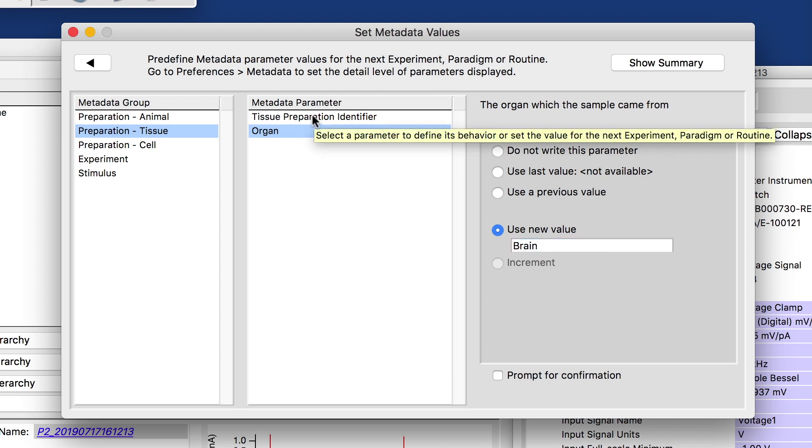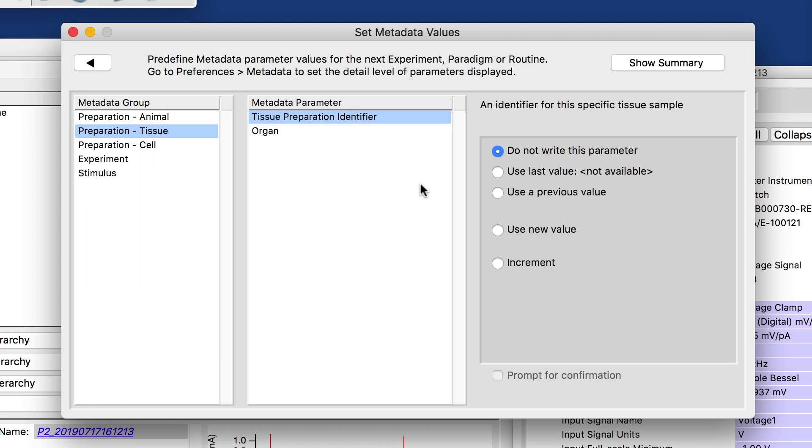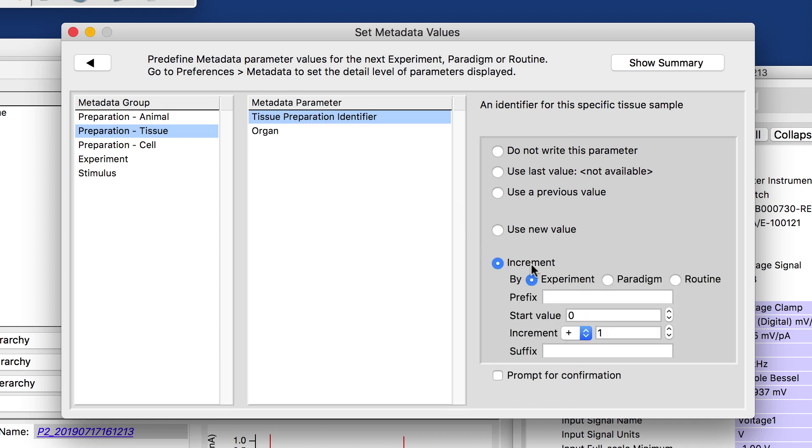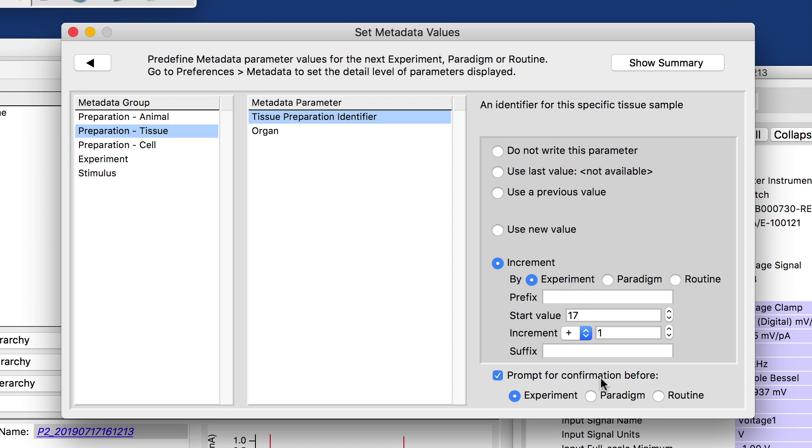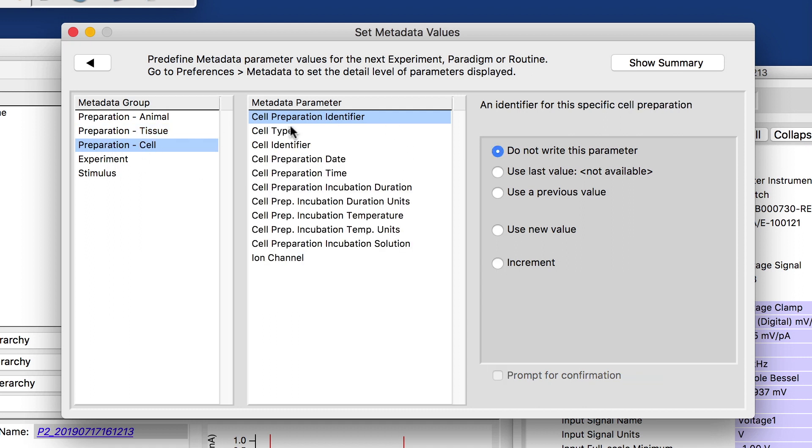In this case, we can create an identifier that automatically increments by experiment. For example, I could start counting at 17 and then increment that by one for each experiment and can also get a prompt or confirmation before the experiment, if I want to make sure I'm really recording from 17 today and didn't skip one that I don't have there. And there's a number of parameters for the cells.